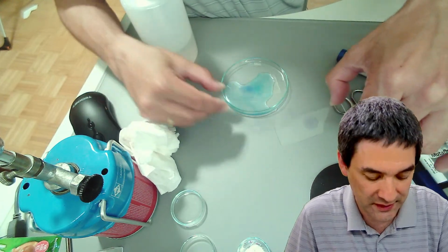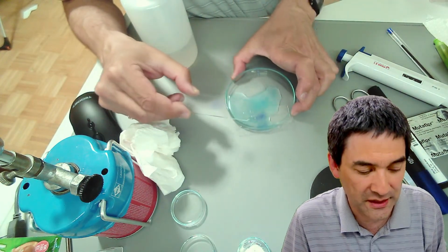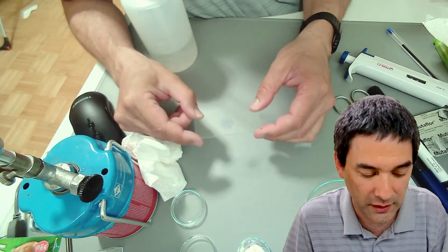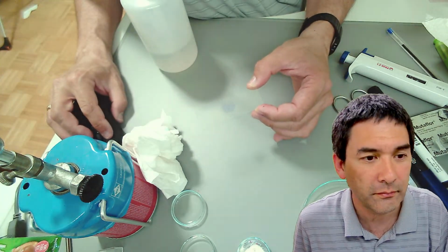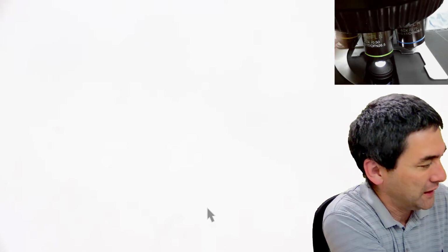So I'm going to put this slide here away, and we just pretend that this one is the slide that we've made. And I'm going to put this slide now under the microscope. And then, believe it or not, it's pretty much everything I wanted to show you. And then I have a little bit of time to actually go through your questions.